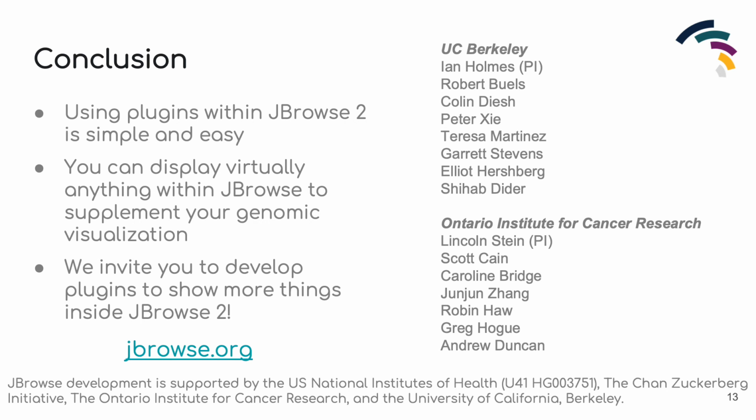In summary, I have presented the capabilities of the JBrowse 2 plugin store and described some usage scenarios for cancer biologists, bioinformaticians, and software developers.